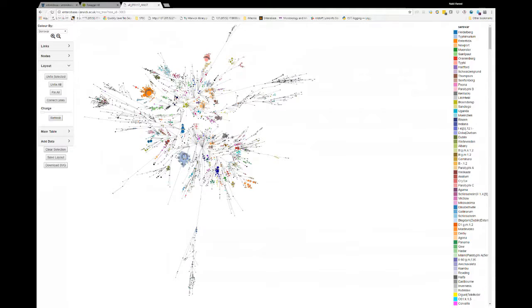But you can still do it programmatically through the API by essentially downloading the ST information for a particular scheme for all of the strains, and then just picking the first one. But that would require at least two or three requests and iterating through it a couple of times.